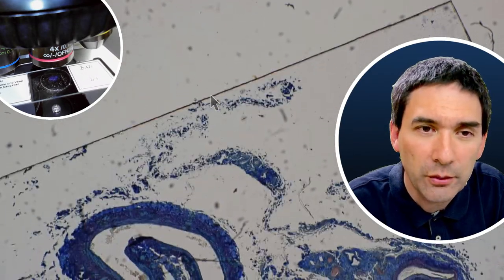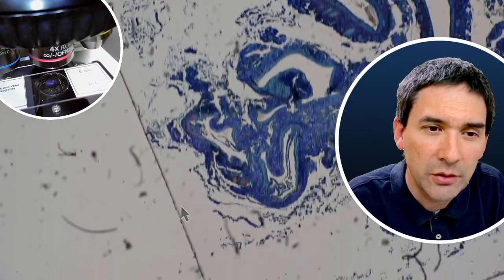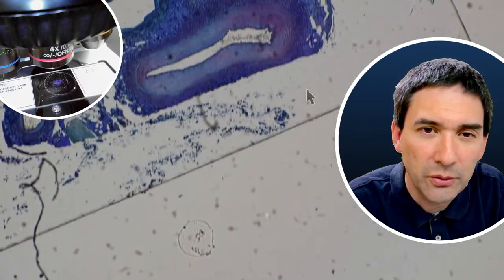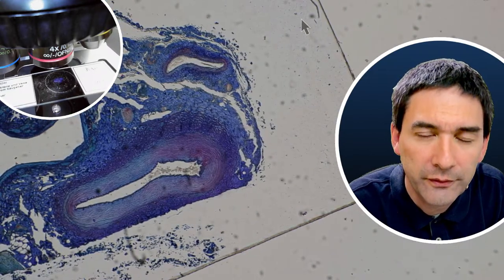Traditionally what they've always used is paraffin wax, and this paraffin wax is then removed. But over here, whatever substance it is, whatever curing material it is, is still present. It's quite interesting. I don't know if you know a little bit more about that. I would be interested in knowing how they have done that.